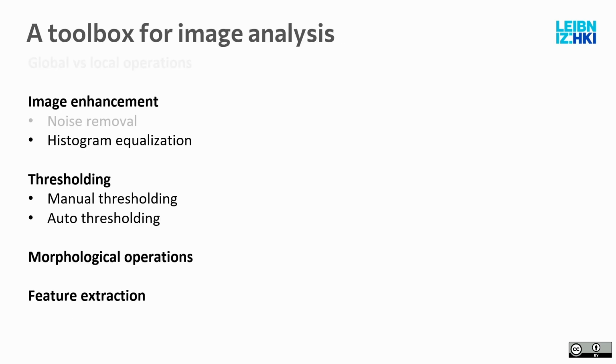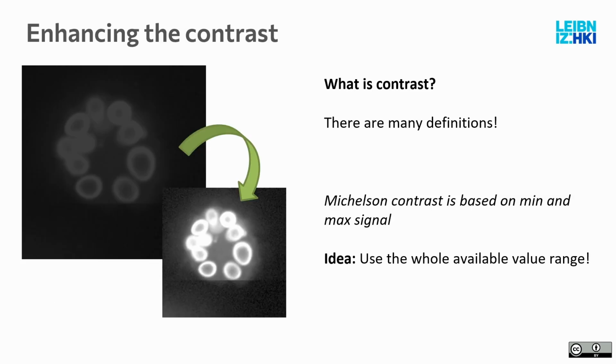So, next, image enhancement. Let's see about another tool that you can use for image enhancement. It's histogram equalization, and this is related to contrast. So contrast, there are like millions of definitions again. What is the contrast? I used here the Michelson contrast.